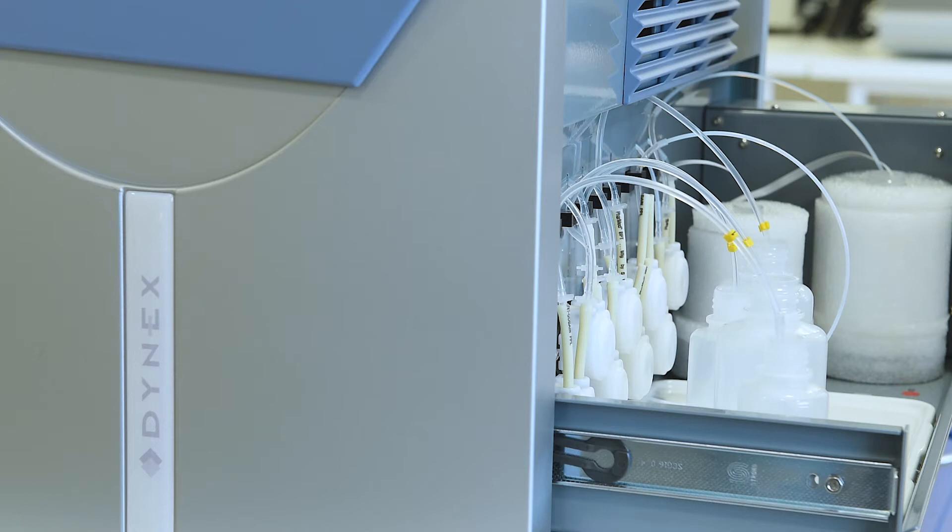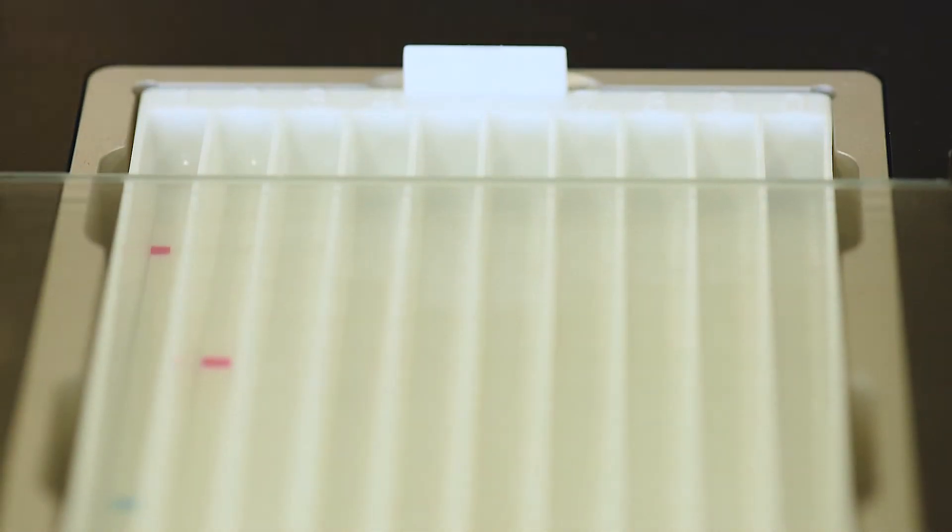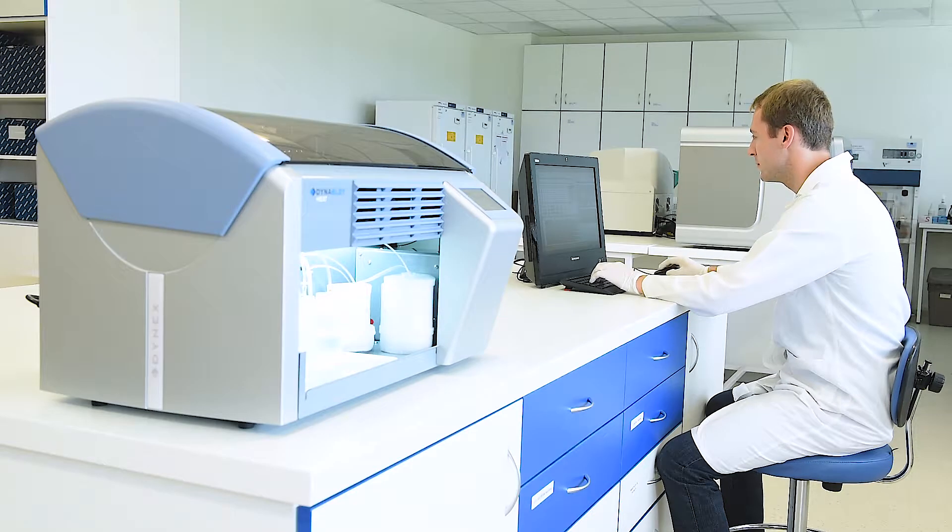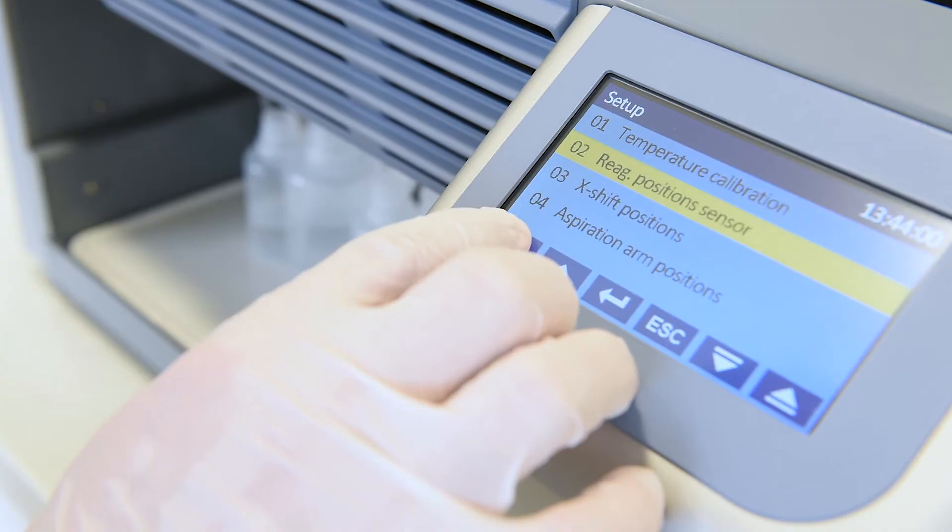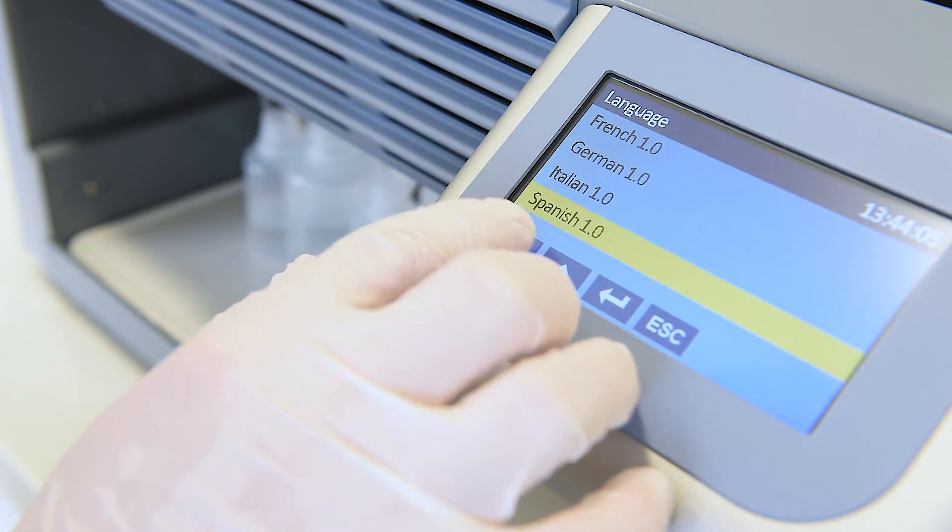For example, in cases when the user loads already preheated reagents. The Dynebolt Heat's rocking tray holders agitate reagents in the wells during incubation. The rocking speed and angle can be adjusted by the protocol parameters. The large colour display with touch screen enables easy and comprehensible instrument operation.